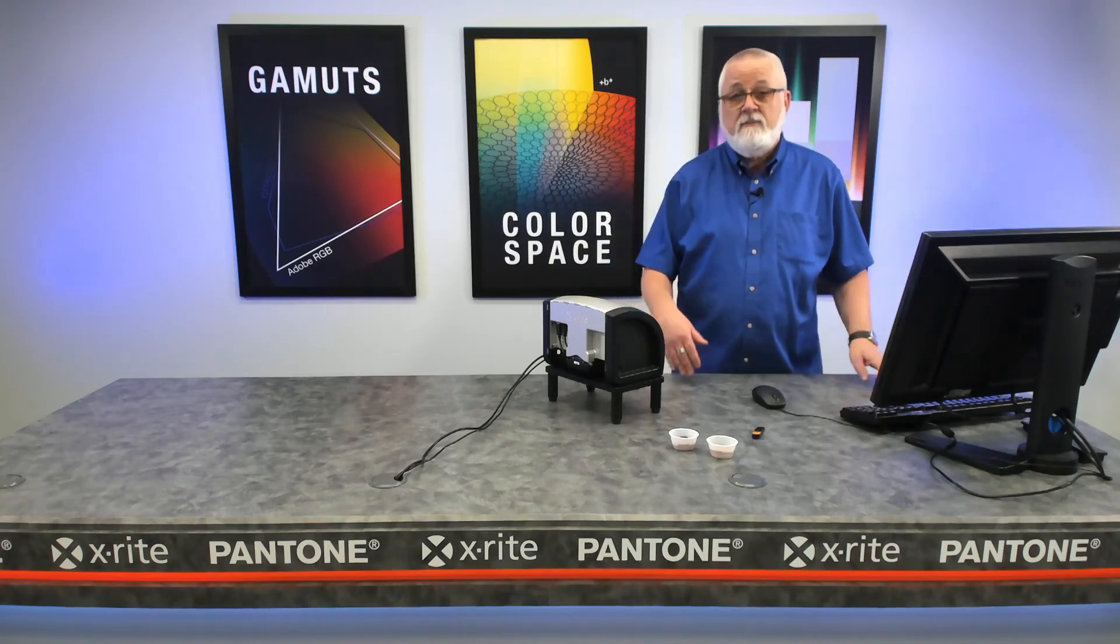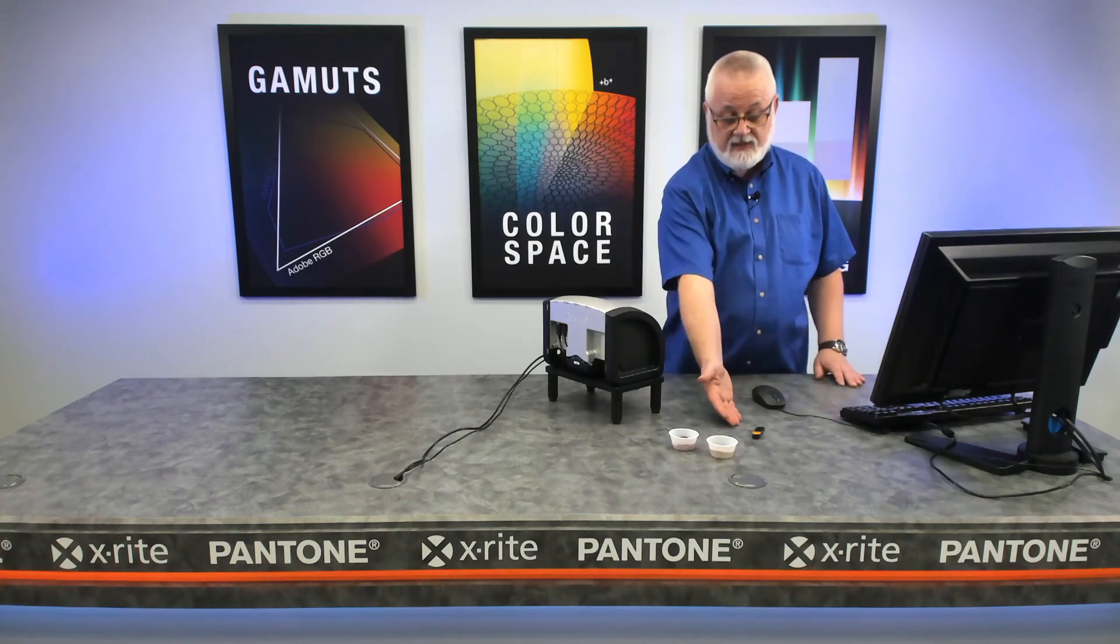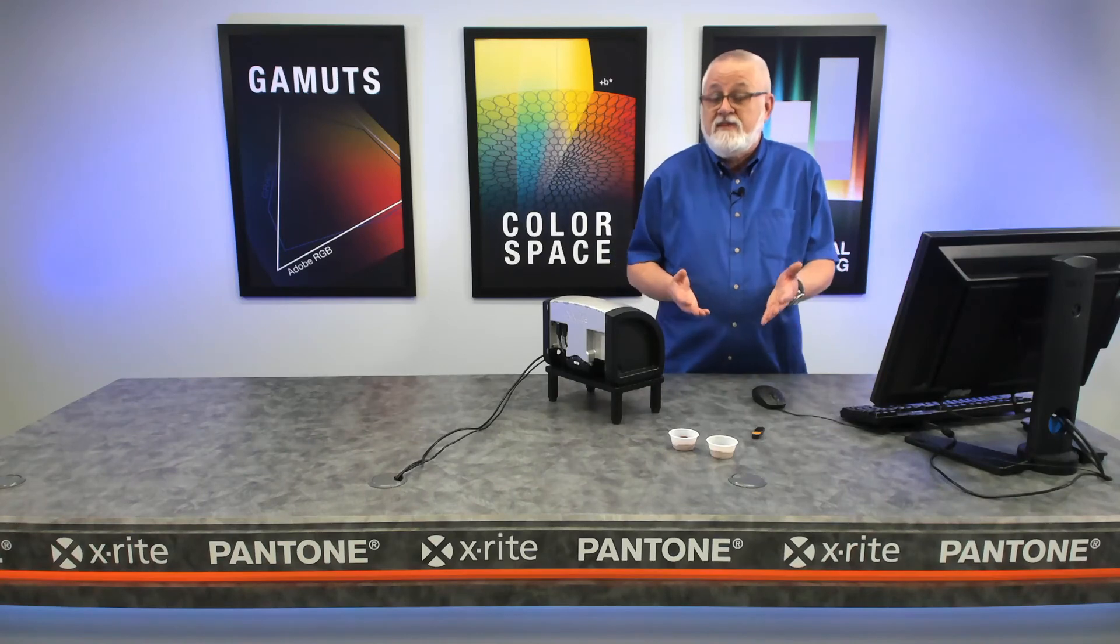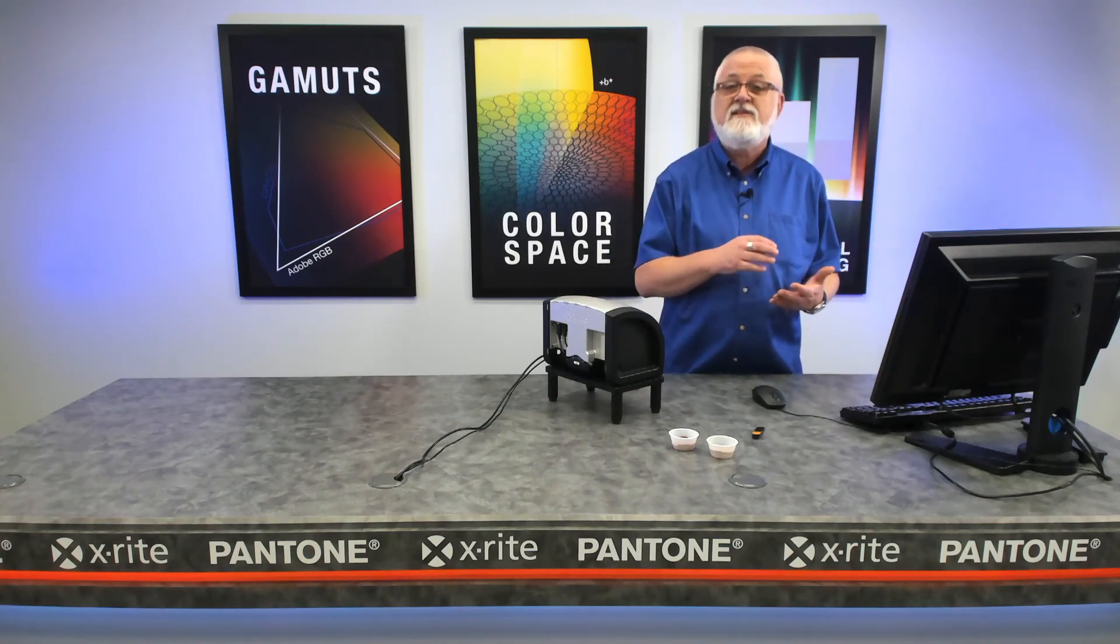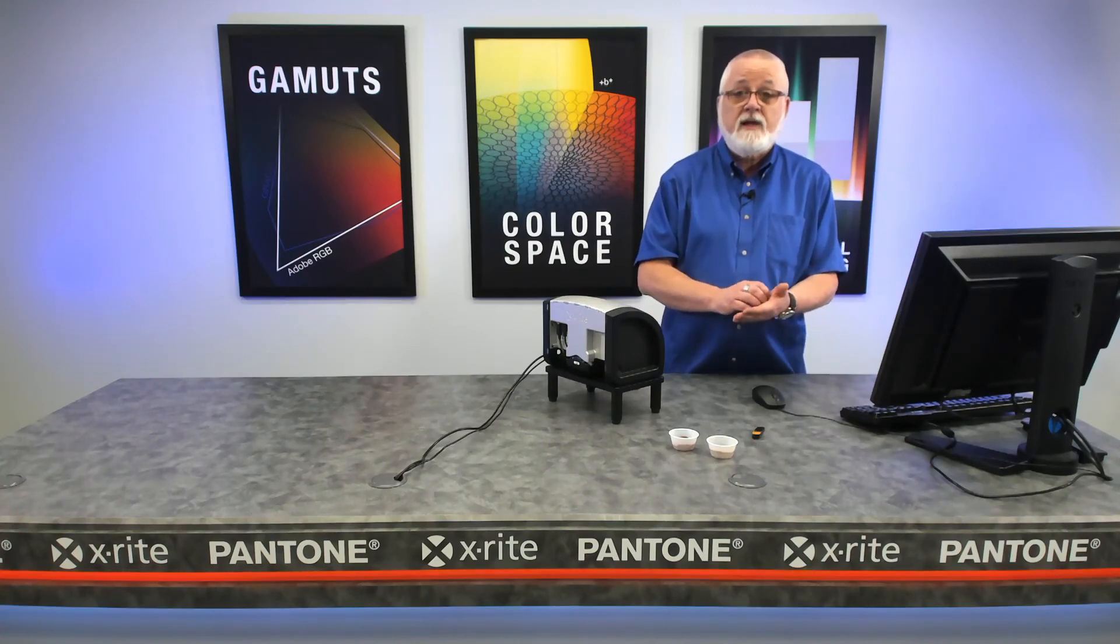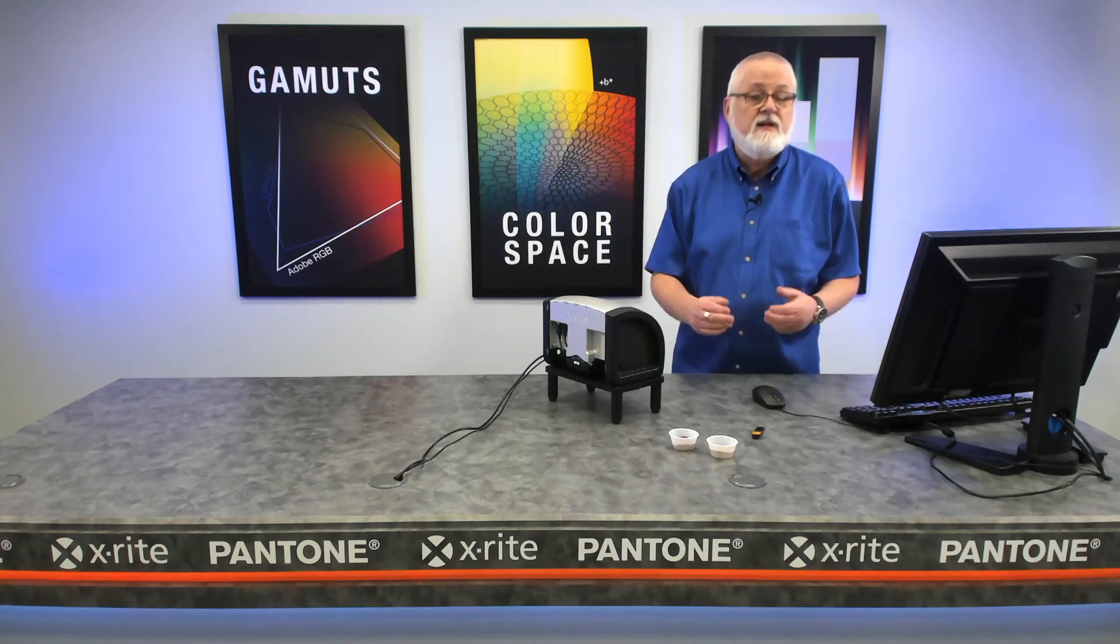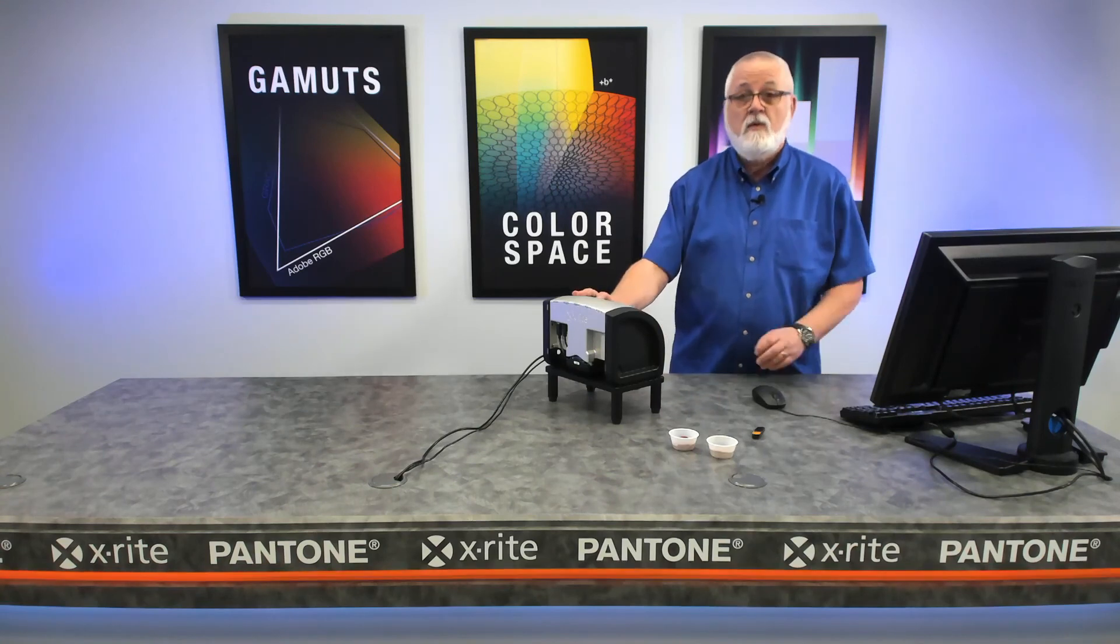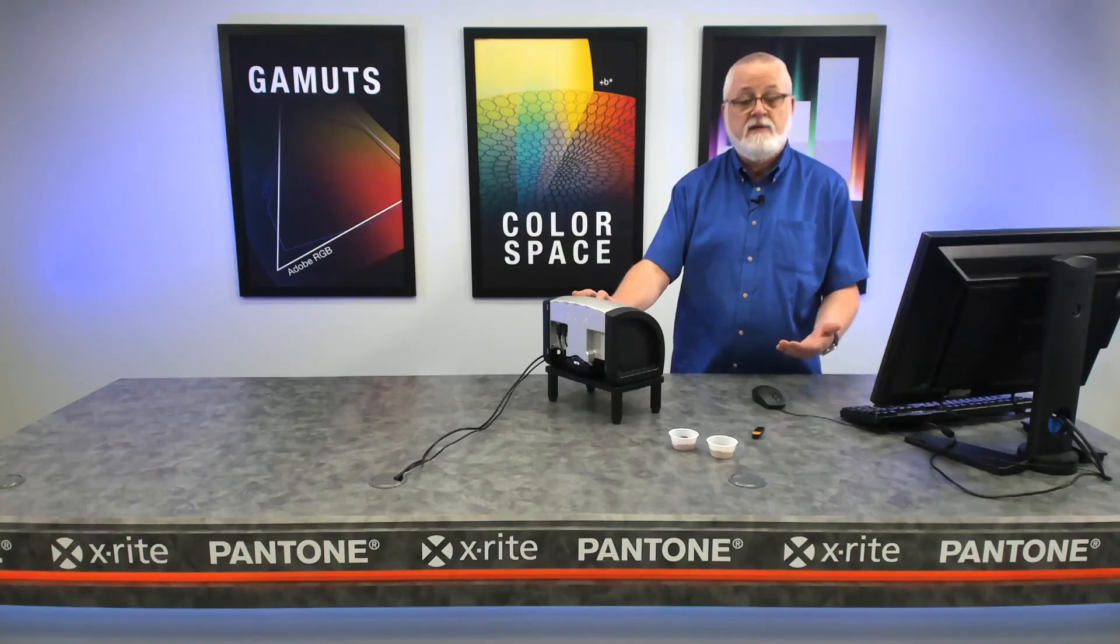So I can measure like the paprika like I did. Maybe I'm going to measure something like cinnamon like the other spoon that's here and judge it with something very specific like the cinnamon index. There are various spices that have specific indices that are used to measure their quality, and based on where they fall in an index can even affect the price that can be charged for those spices. So it's a very important thing. This instrument with this stand and the spoon and the drawer allows us to measure those powders and those liquids.